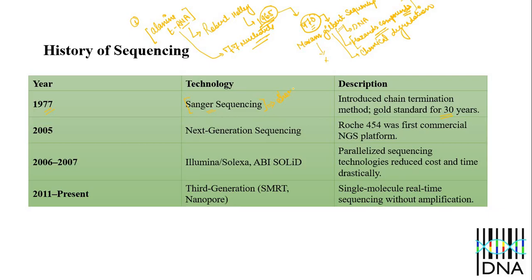This is the limitation of the method: we sequence only short DNA sequences.